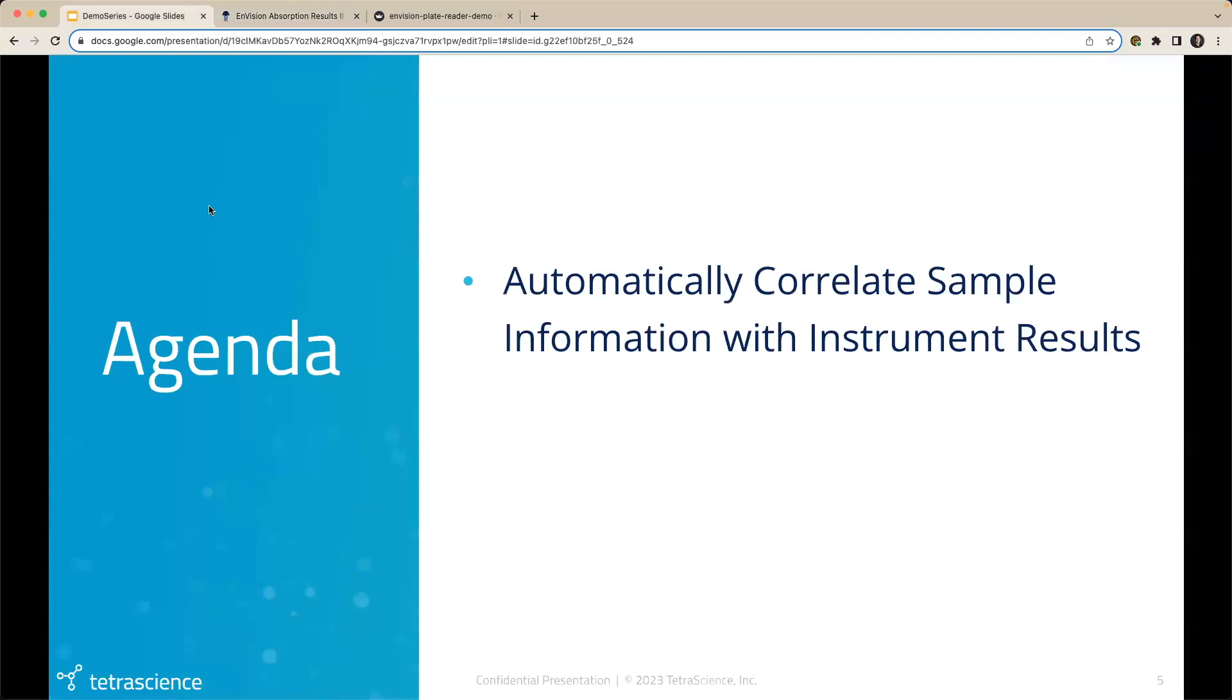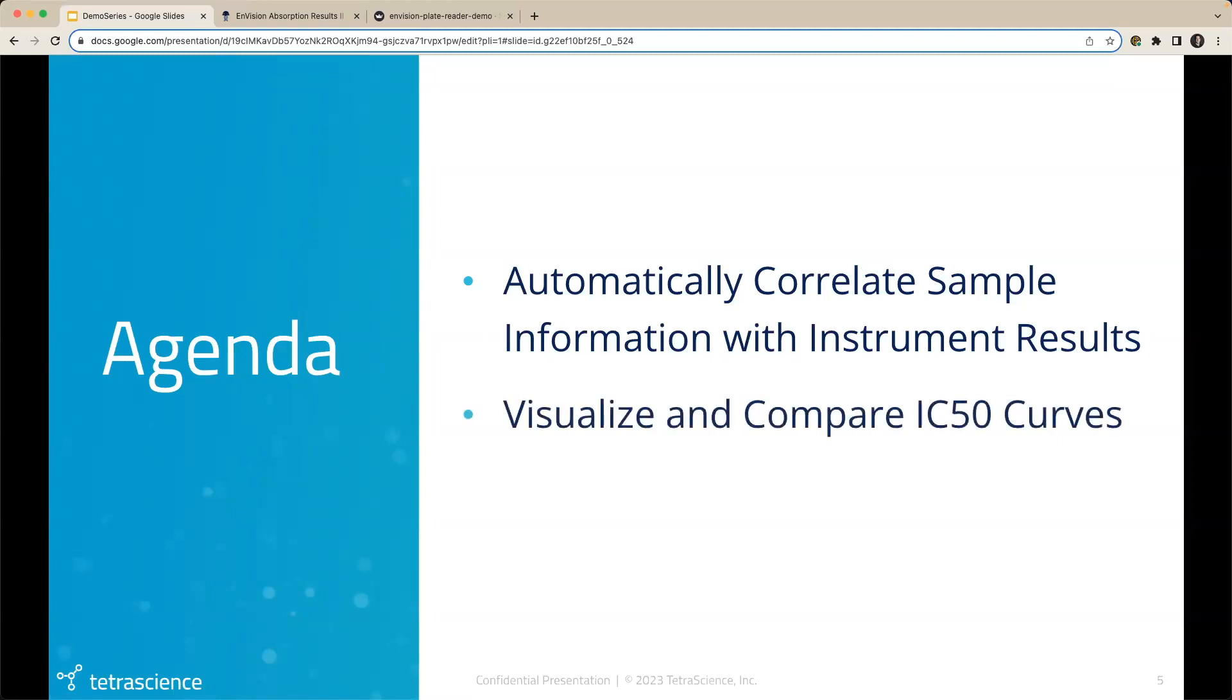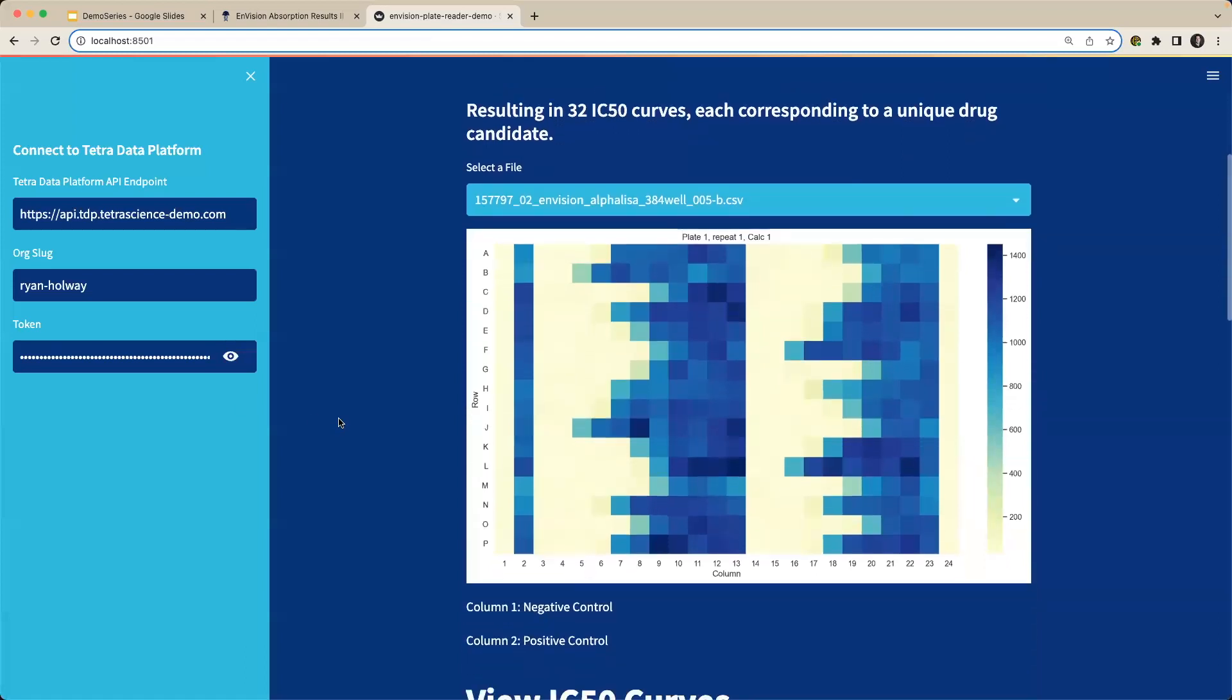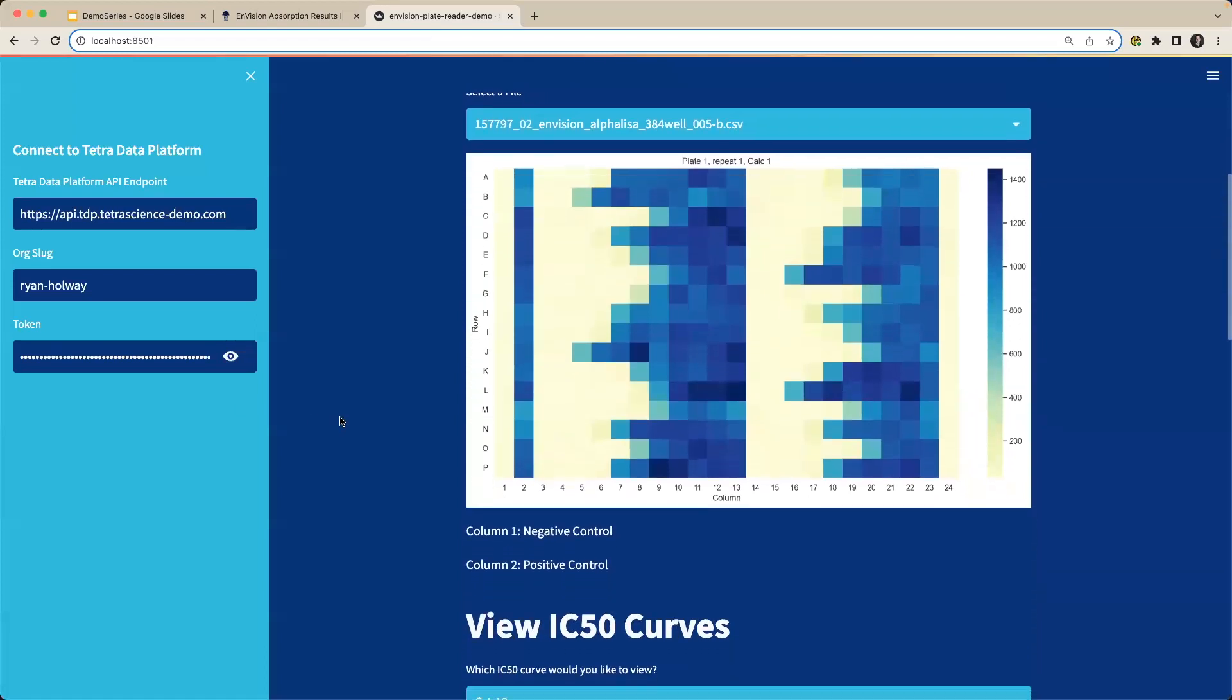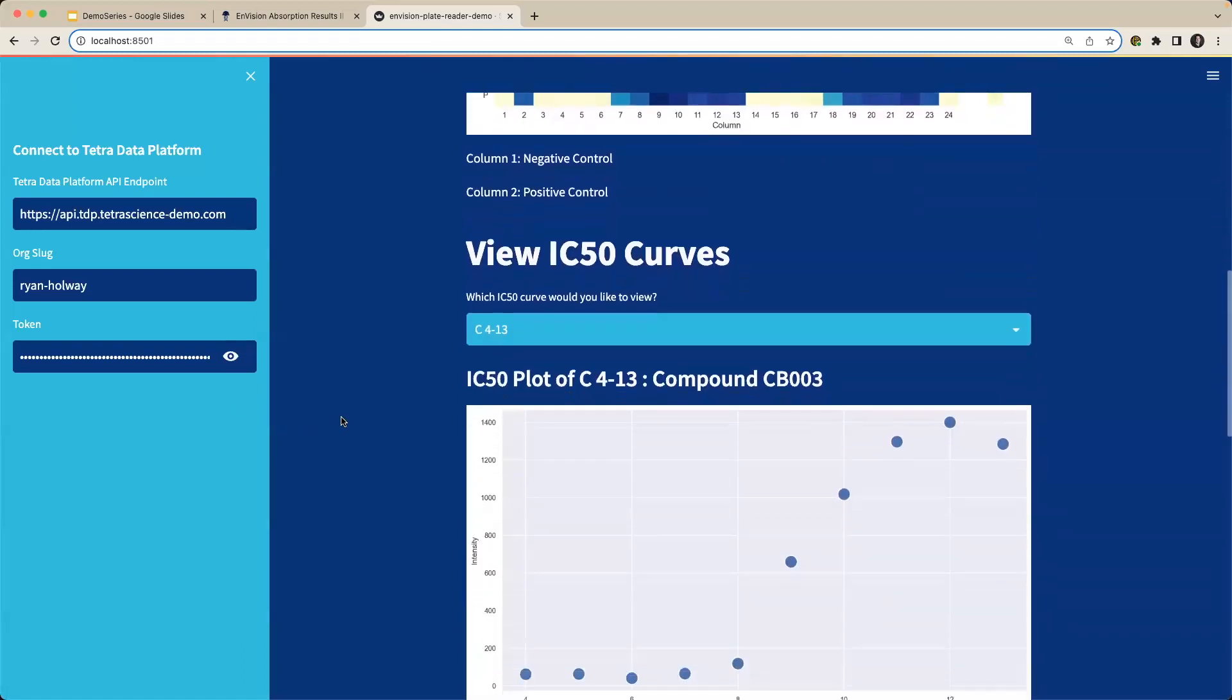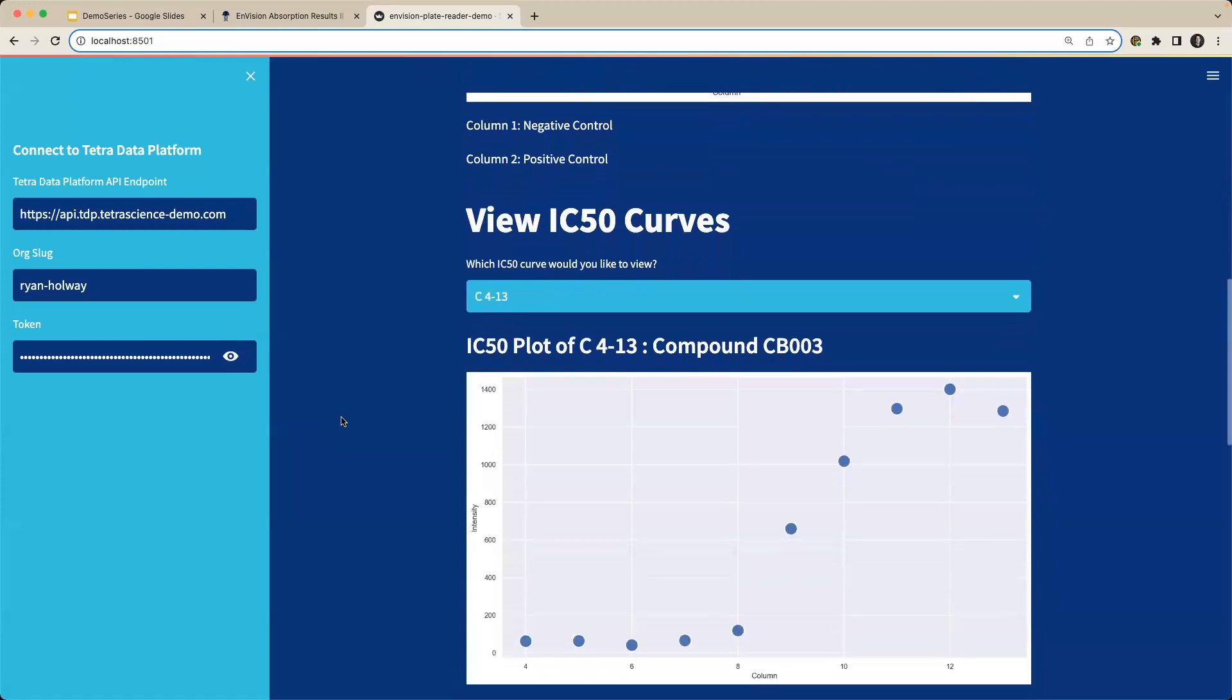Then, we'll see how those plate reader results can be visualized and compared against each other. This is an application we built to view our plate reader data as a heat map, as well as select and view IC50 curves to analyze, which I'll discuss more momentarily.